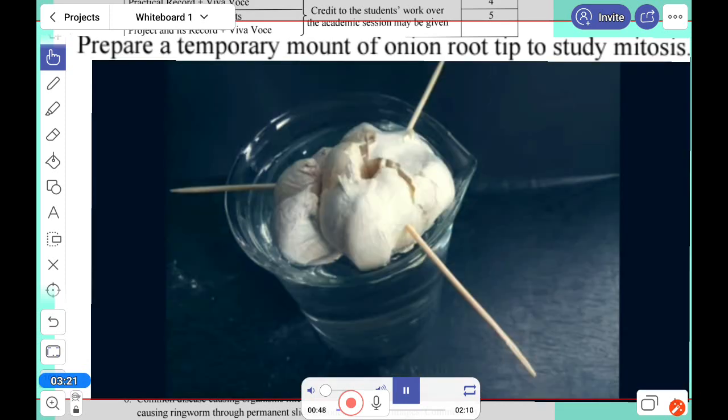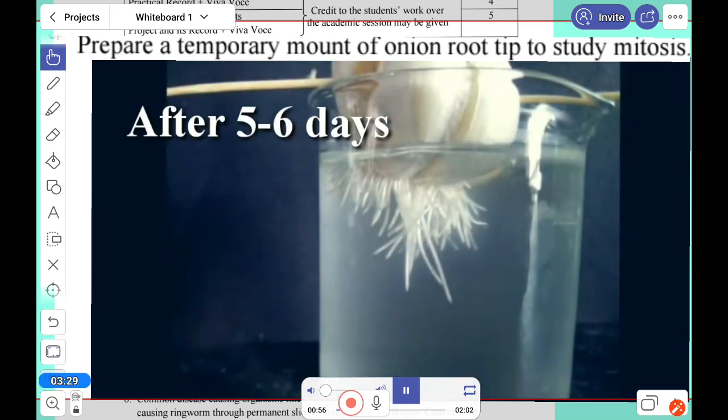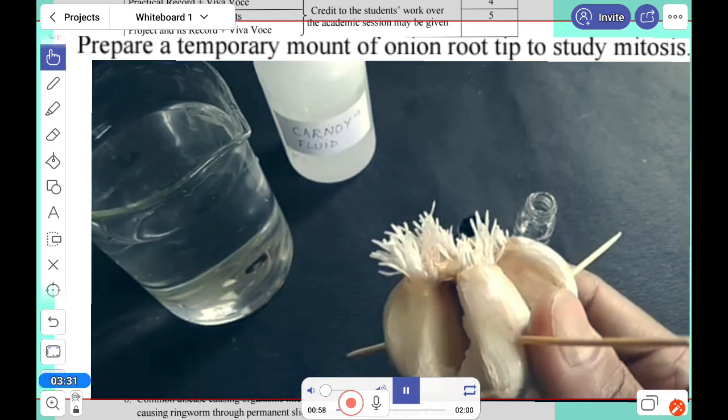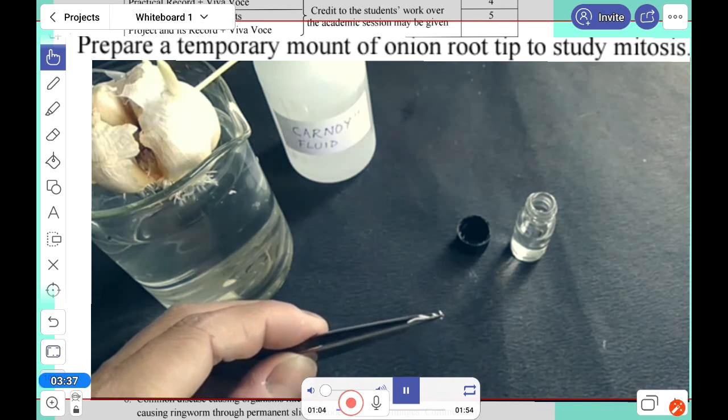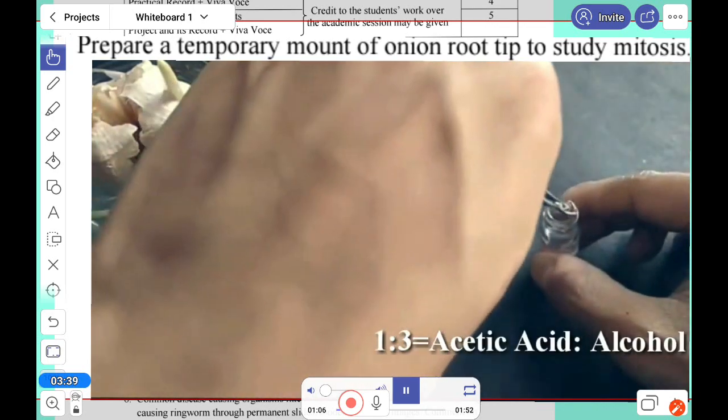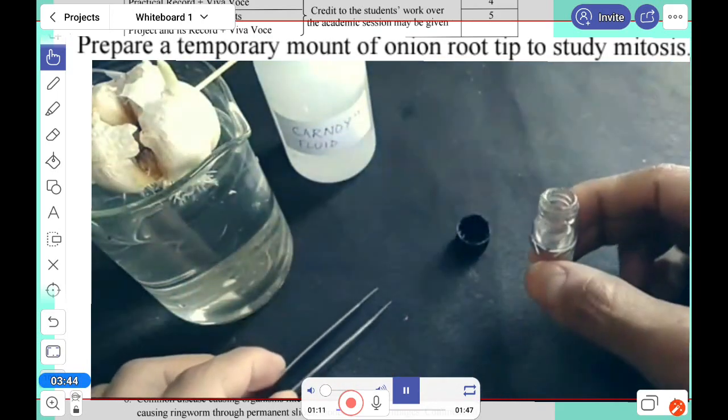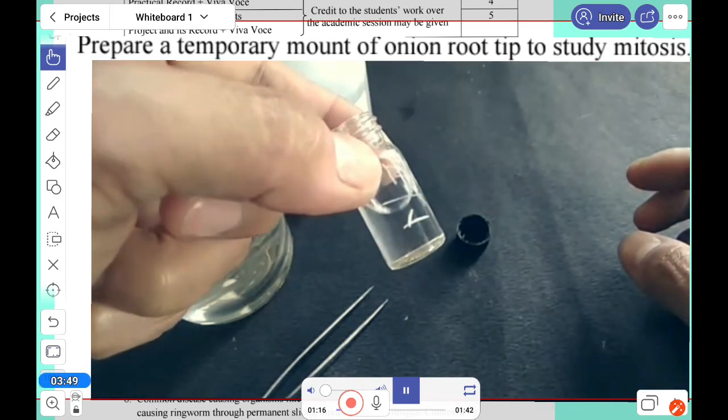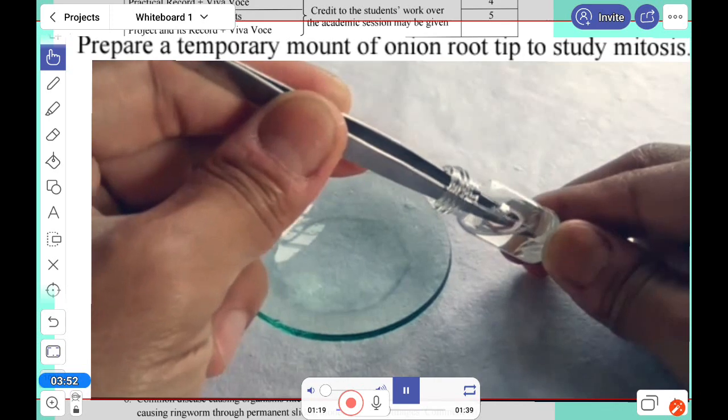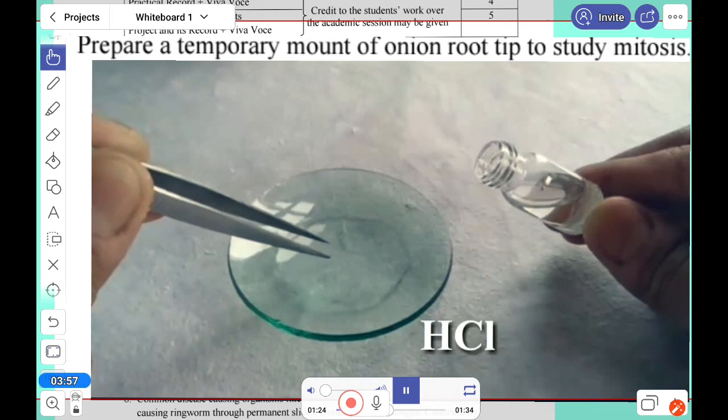Now the process. Here we have taken the garlic and we have scrapped the old roots. After five to six days in plain water, the roots emerge. We have to take out one centimeter in daytime and keep it in acetic acid and alcohol, one is to three, in an empty vial for 48 hours.